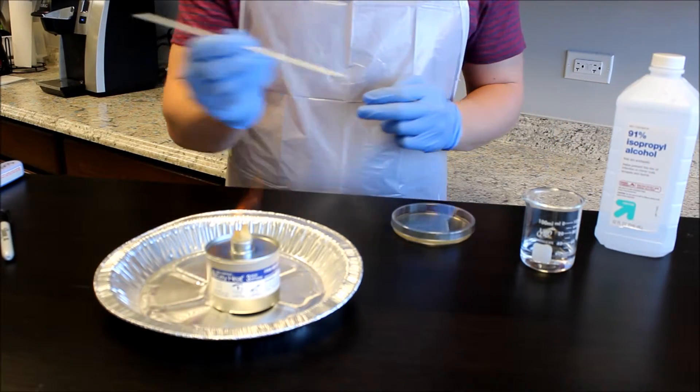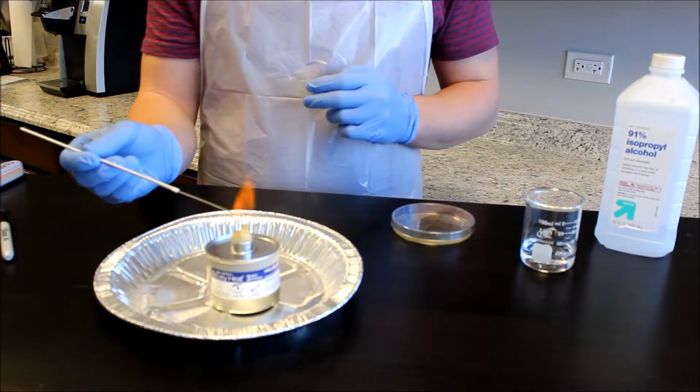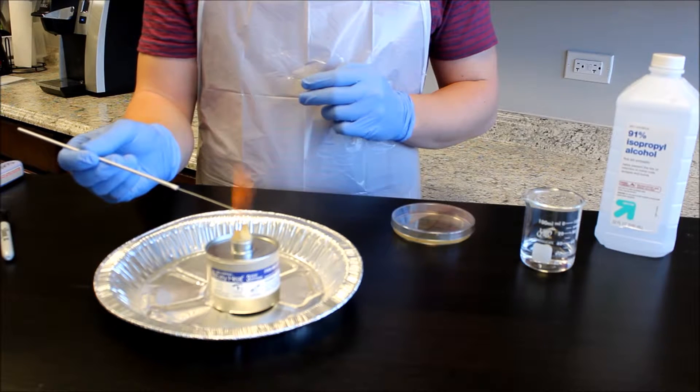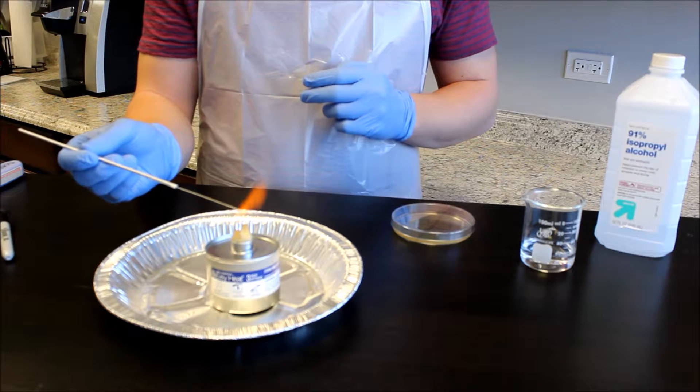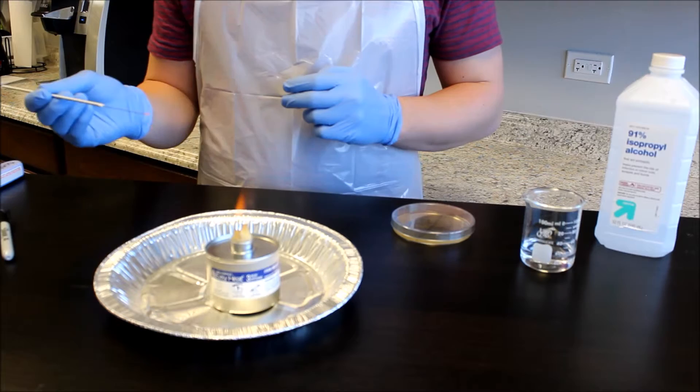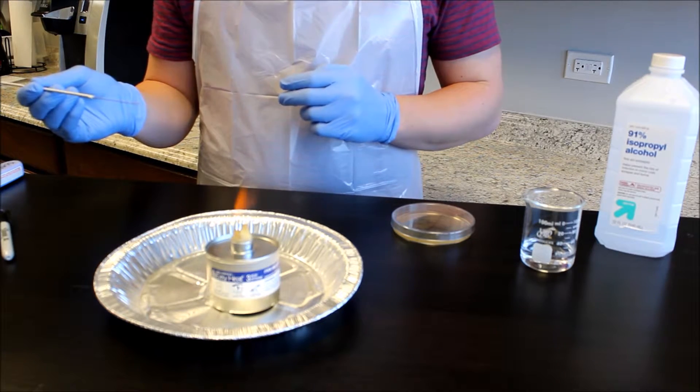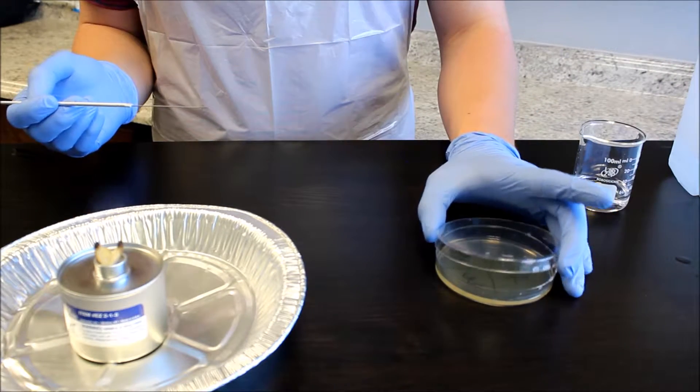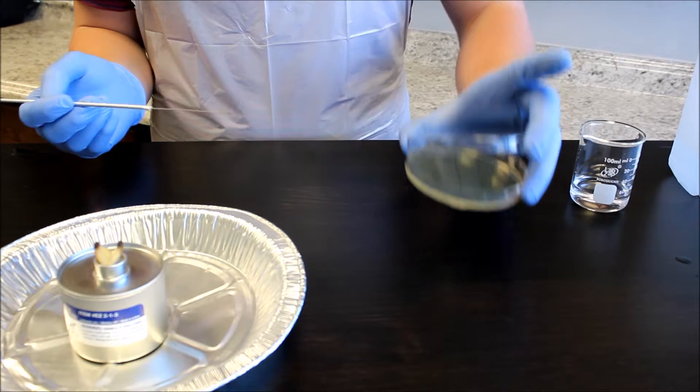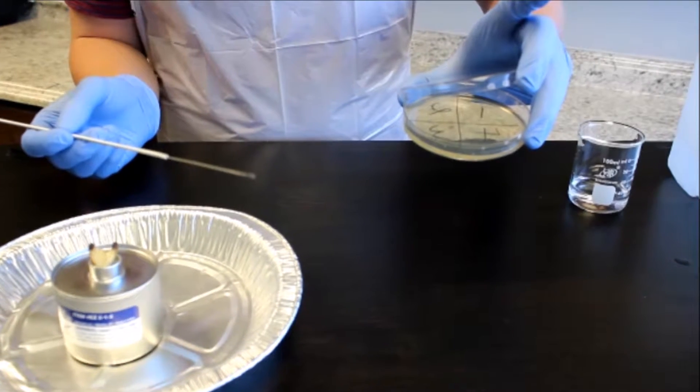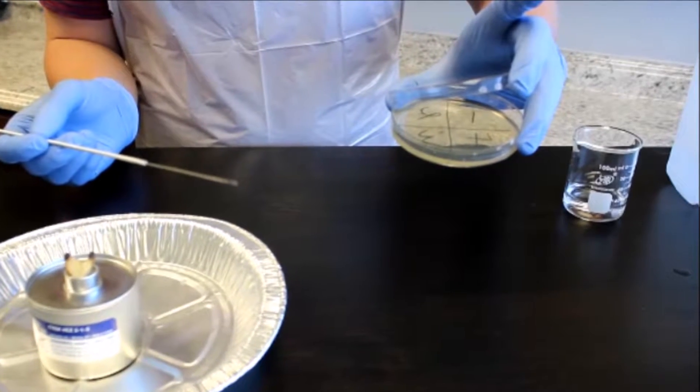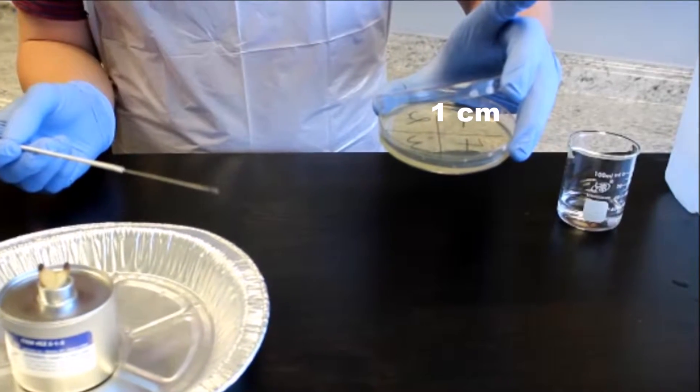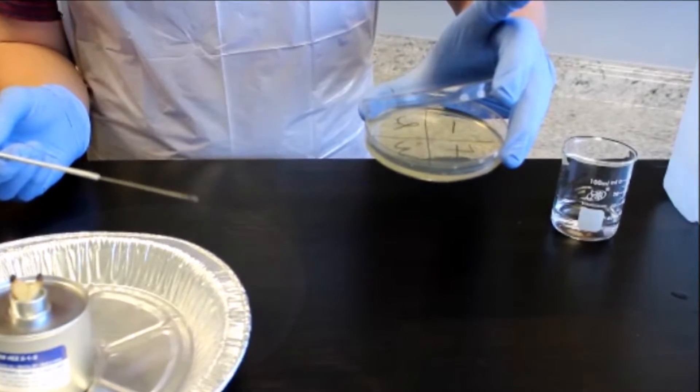Remove the loop from the alcohol and position so the loop is in burner flame. Hold in flame until metal glows red. Remove from flame and allow loop to cool for 30 seconds. While holding the cooling loop in the dominant hand, grasp the agar plate with the other hand, tilting the lid such that a 1 cm space is opened above the first quadrant.